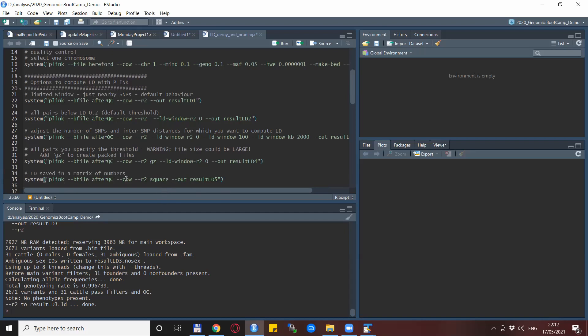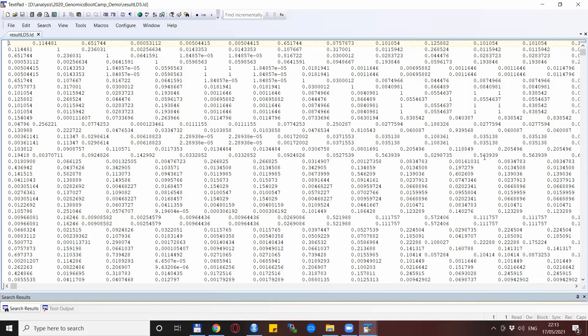There is also an option to produce not just pairwise results but a square matrix of numbers. For example, if you want to create some of the neat heat maps shown in previous videos, you can do that easily with the --r2 square option. It produces a large matrix of R² values which you can then use to produce any type of output such as the heat maps we were speaking about.